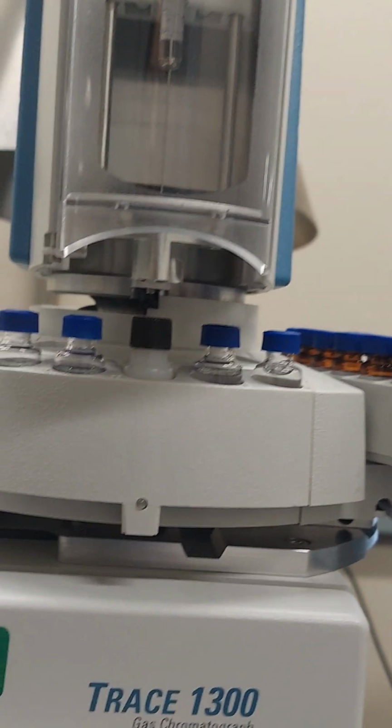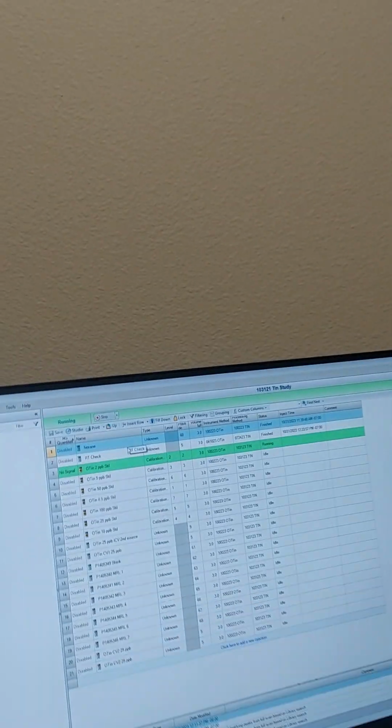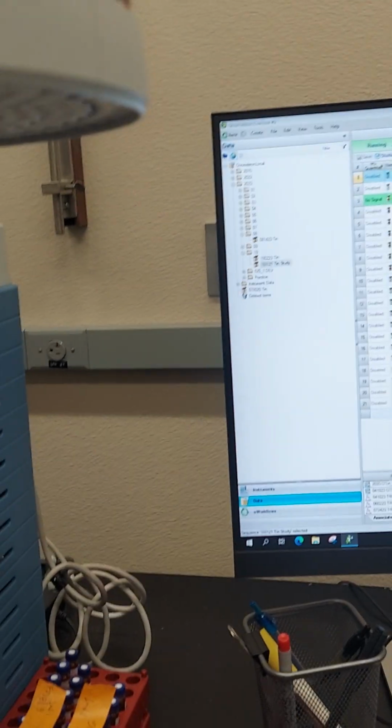And then before this, I changed the liner. So to start, you just press play, this button. Okay. Just play and that's start.